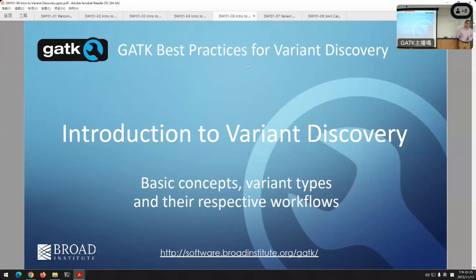We'll take a small break and then he'll talk about joint calling, which is bringing all your data together from all your samples. But if anyone has not yet, if the cloning didn't work or you have a problem, please let Aaron, Anton, or Emma know in the back so they can help you out so that when we do get to the hands-on exercises, everyone is ready to go. Okay? Any questions to start with? All right, in the other room, if you have questions, just come running over anytime.